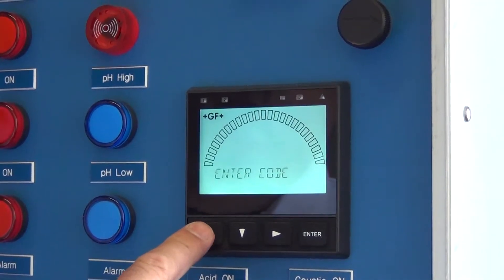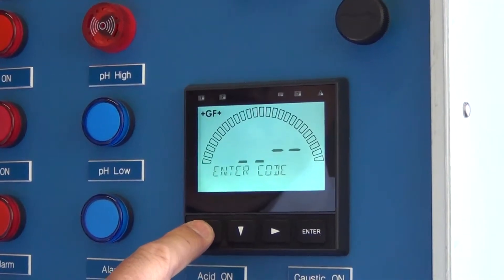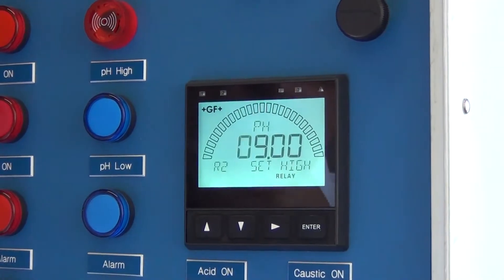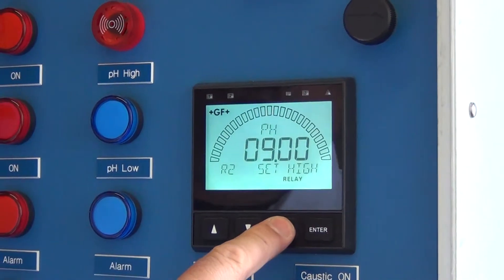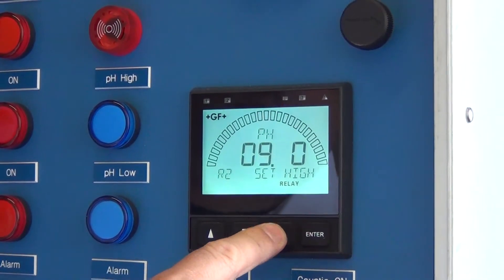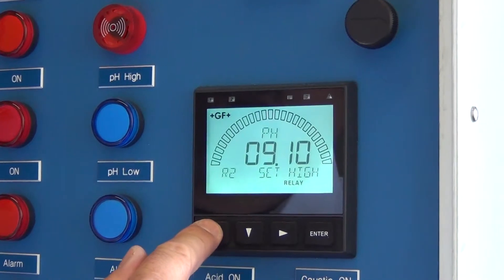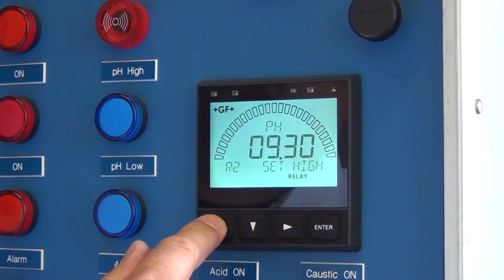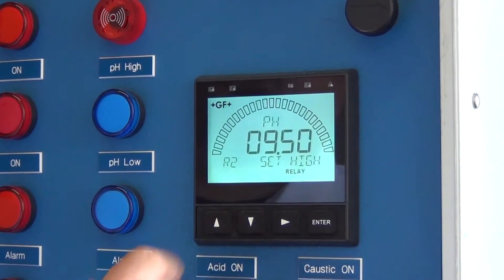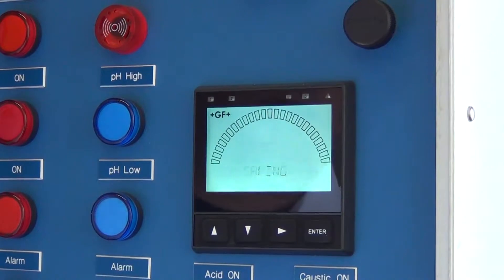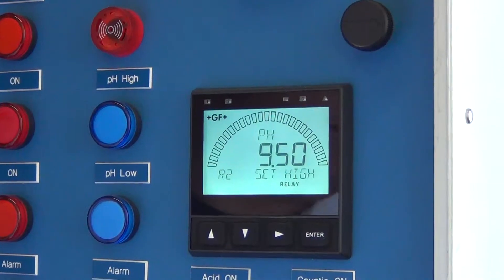The default code is up, up, up, down. Choose the digit you want to change, make the change, then hit ENTER.